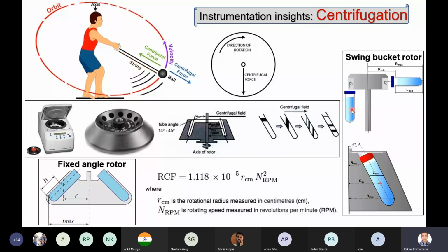This is very much required in enzyme assay because we are going to use plant samples, which are solid samples. We are going to crush them in some solvent and extract the inner material in the solvent. But we don't need the crushed plant sample. We need to move it out. So how do we differentiate between the solvent and your plant sample? This is the way you can do it.